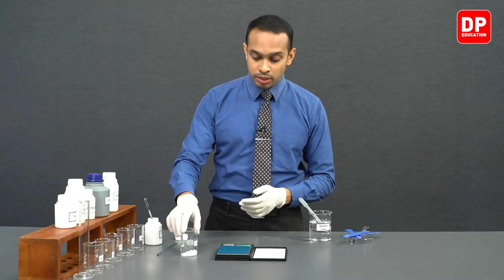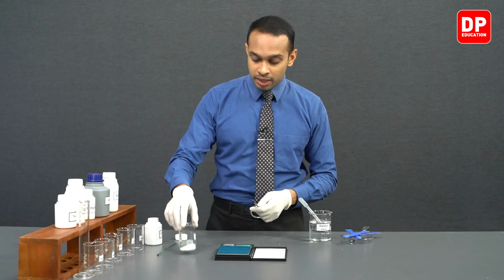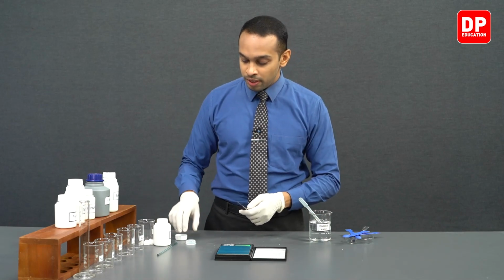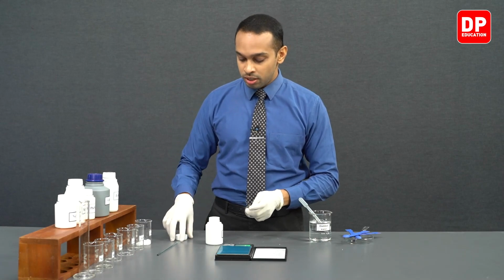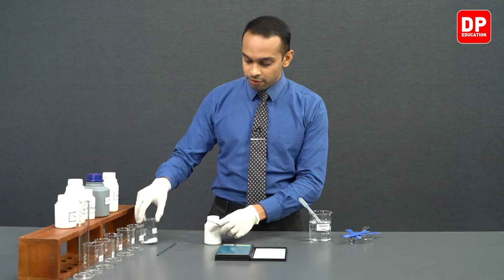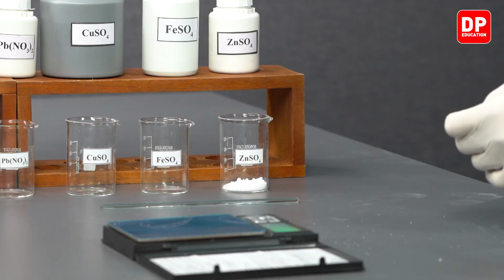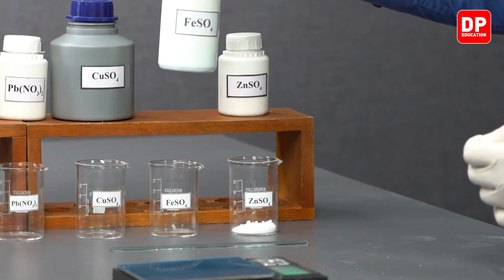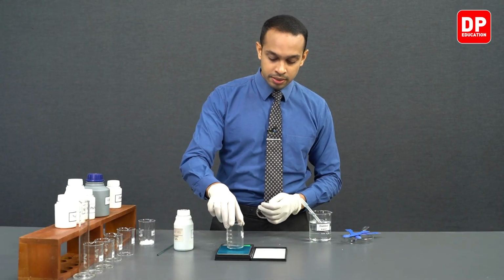So after measuring zinc sulfate solid over here, we can keep it aside. We will add 50 milliliters of water to each of these solutions later on. We measured the mass of zinc sulfate first. We'll leave it aside, and then we can move on to ferrous sulfate. And we have a beaker labeled ferrous sulfate.